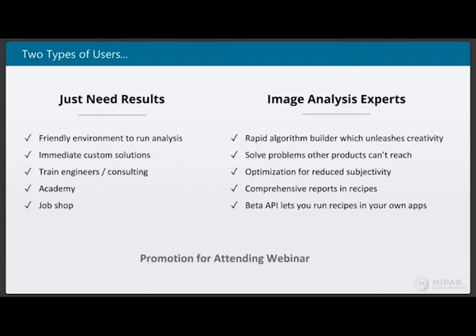And MIPAR has a very nice color deconvolution tool that lets you simply manually circle the different minerals, and it will generate a channel operation that is representative of that color. So basically that's the first approach I would take.